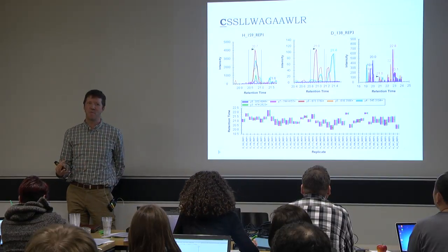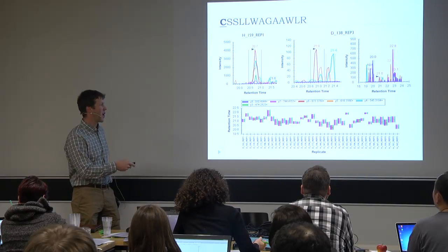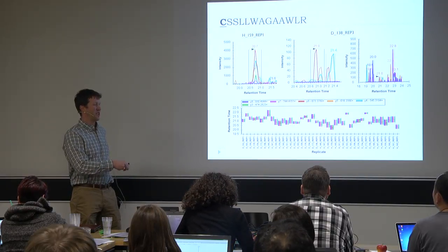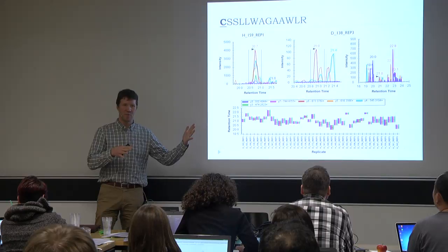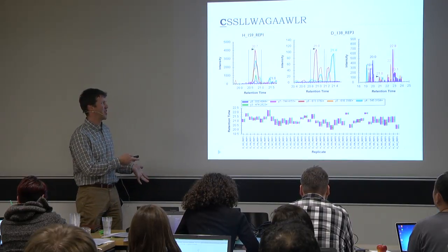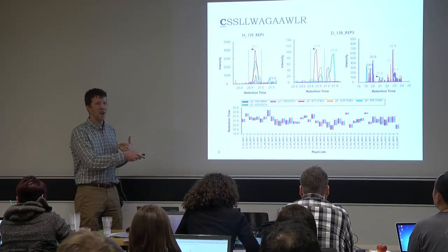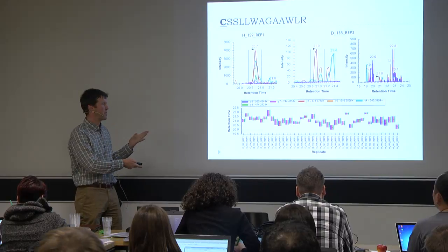So this is one of the problems with the data set. There's no randomization, but at least it's in cycles, and so it's hard to believe that we could have been changing the chromatography so that this peak disappeared and then came back and then came back. So at least we can guess that it's probably not there. If there's nothing there, it's because there is no peptide to measure.